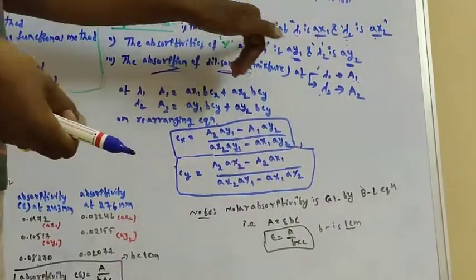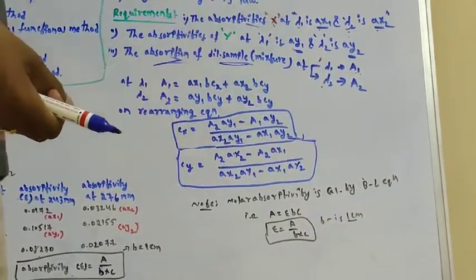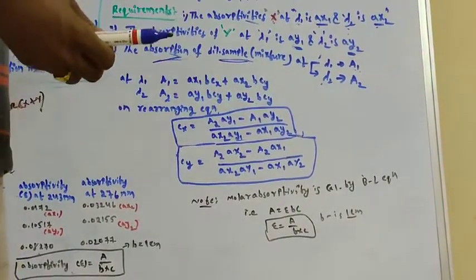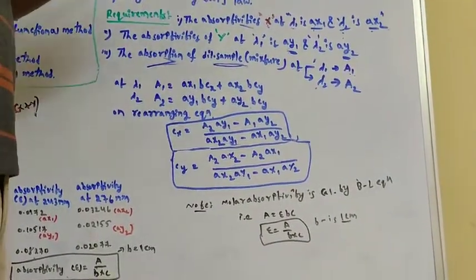You see here, for X and Y separately we have to prepare standard solutions. Separately we have to check the absorbance of the standard solution. For X, separately we have to prepare some concentration.